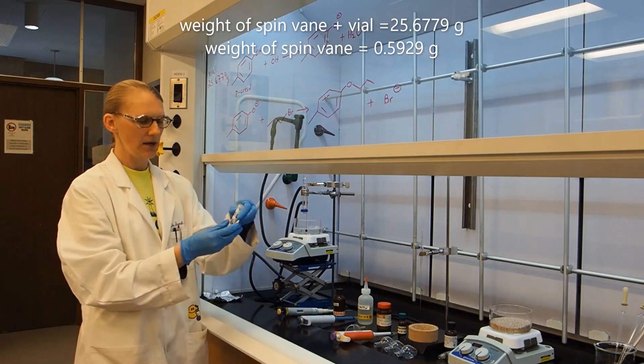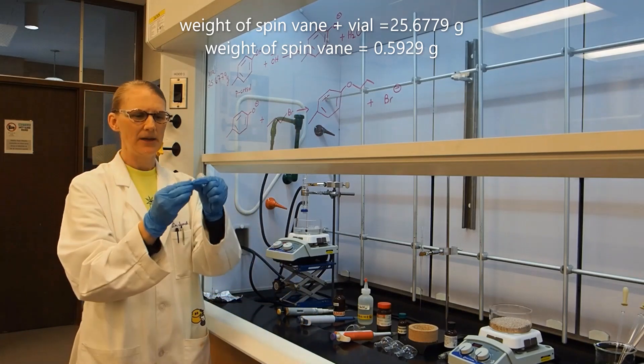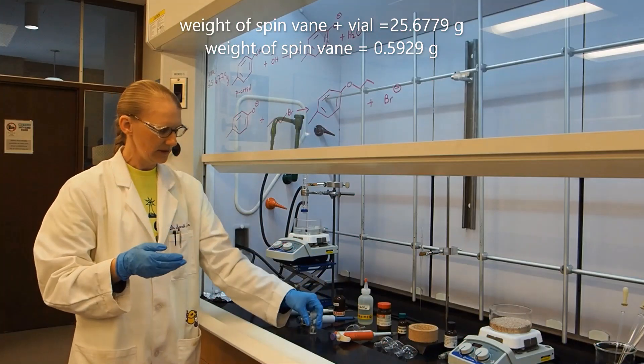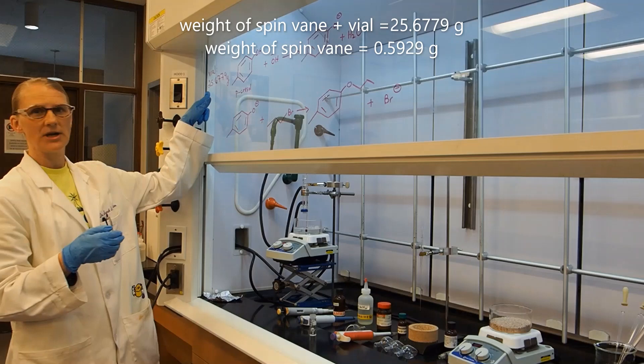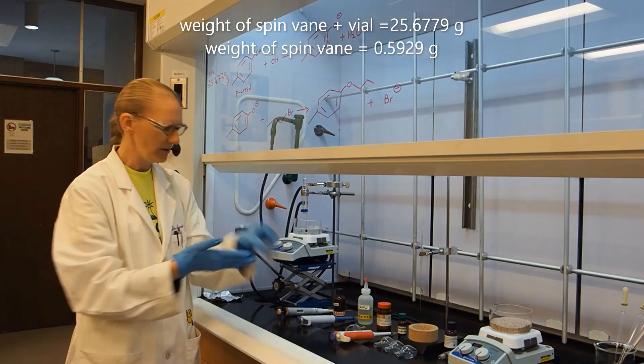I have already weighed a conical vial with p-cresol and a magnetic spin vane inside. Together the vial and the spin vane weigh 25.6779 grams. I did that off camera.